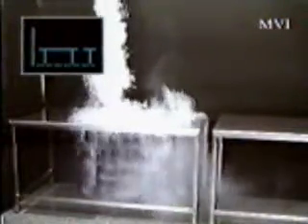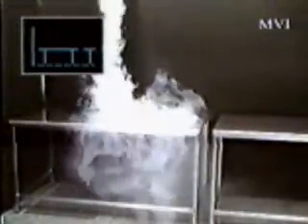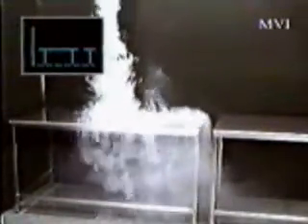Leave a 10-centimeter space at the back and sides, and a material improvement is immediate. The factors which will determine design efficiency are the worktop area and its relationship to surrounding vertical surfaces. A problem is at low level, where turbulence is created, leading to dead areas which are probably rarely flushed by clean air.